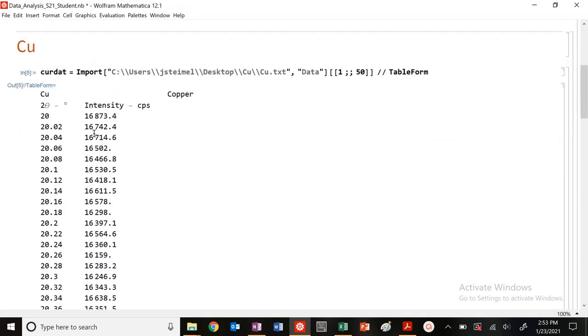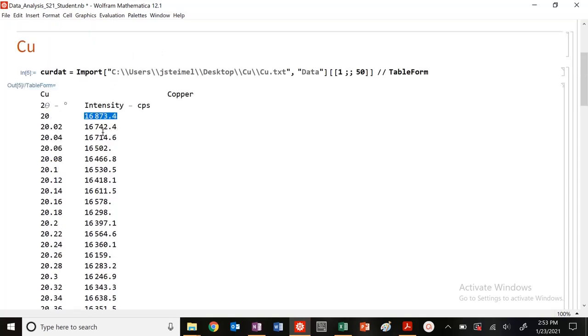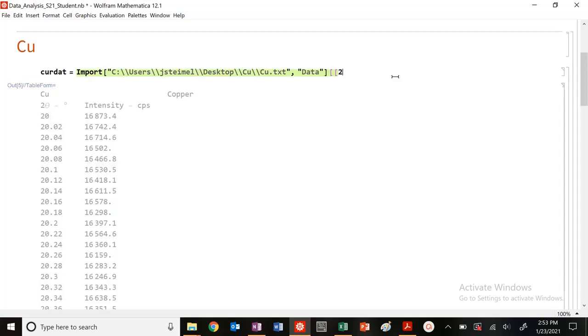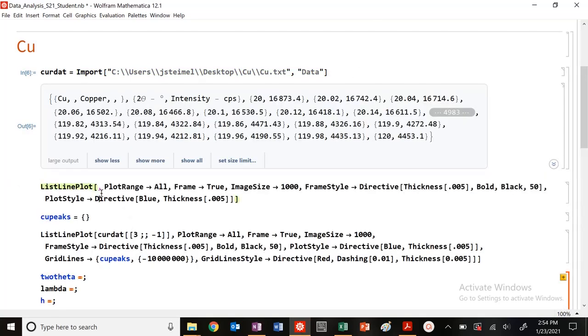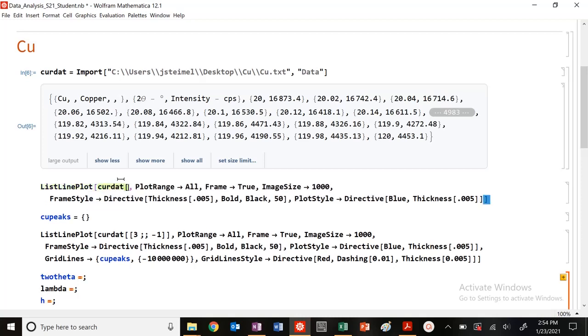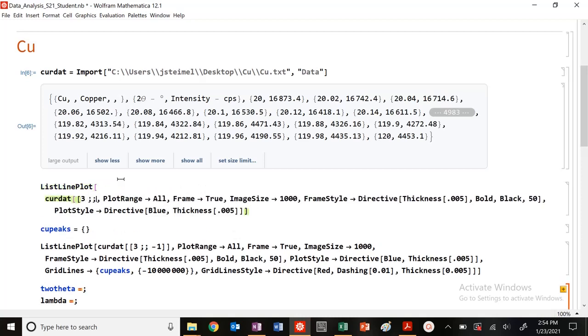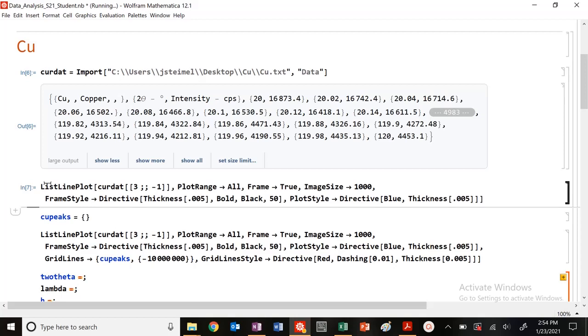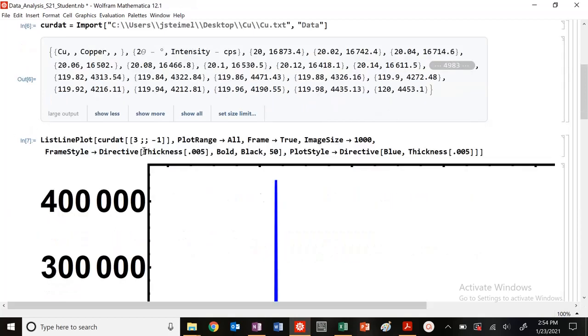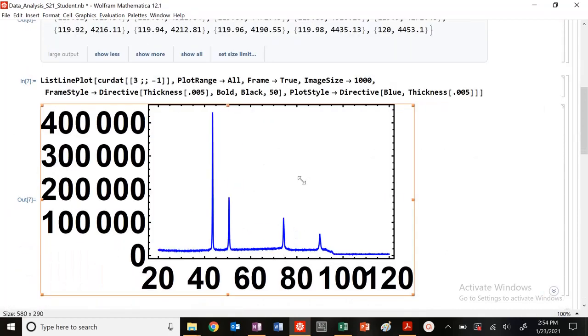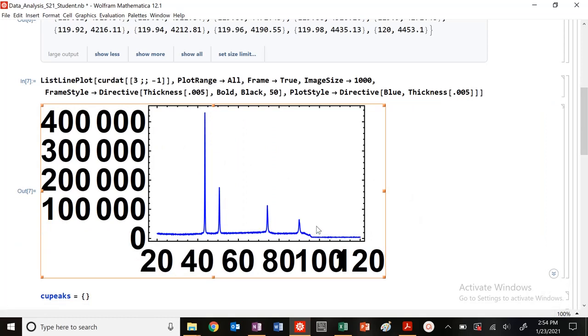This is copper. I have my two theta in degrees versus the intensity in counts per second. So those are your axis labels. I have these two rows of junk that I don't want. I'm going to take from three to minus one and plot this using our nice and pretty form. Excellent. It looks like a metal to me - nice, very sharp peaks.